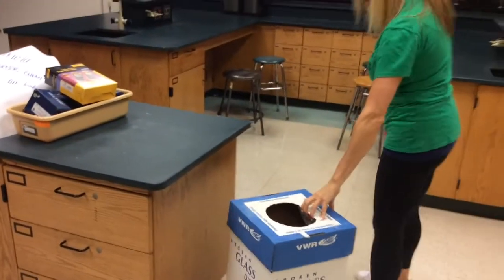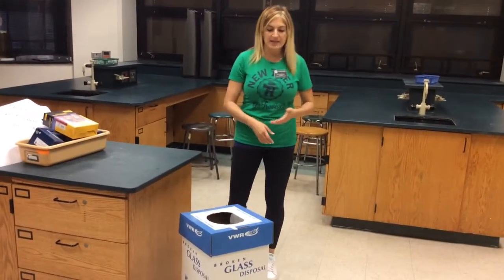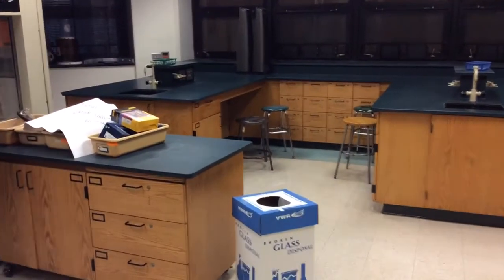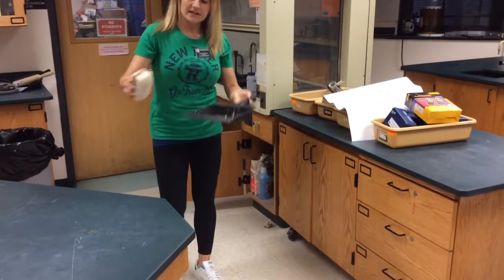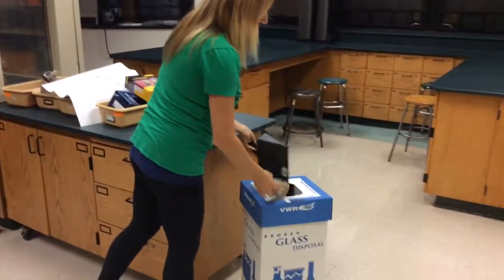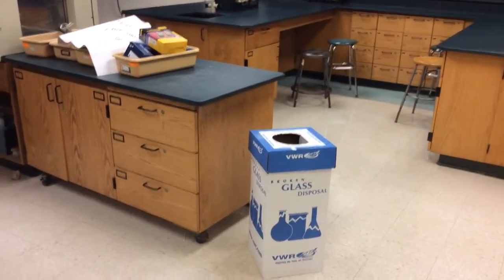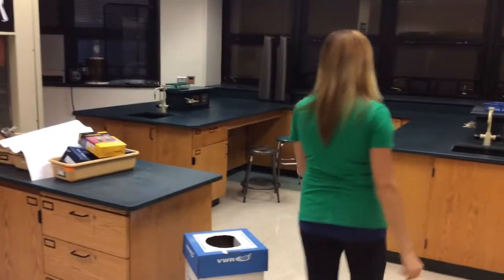All right, over here is our broken glass bin. This is really important. We ask that if your glassware breaks, and sometimes accidents happen, that you use a dustpan and a broom found right here. Go back to the hood. I clean up my spill, my broken glassware, and I drop it off here. I don't want to put broken glassware into the garbage because when PPS comes and cleans it up, we don't want them to get injured. All right, and I think that's the end of our safety video.